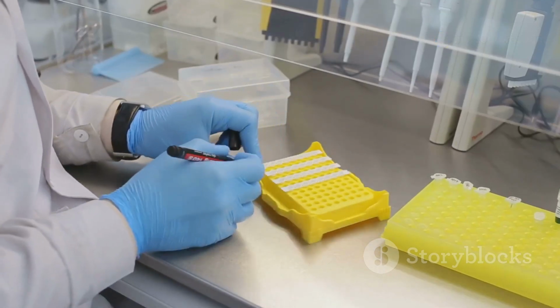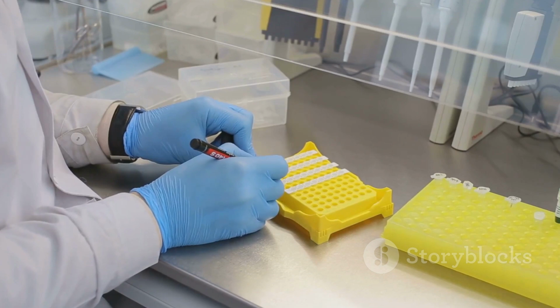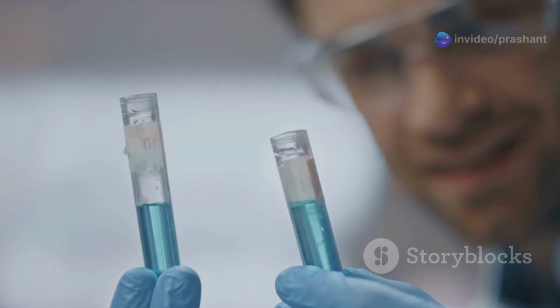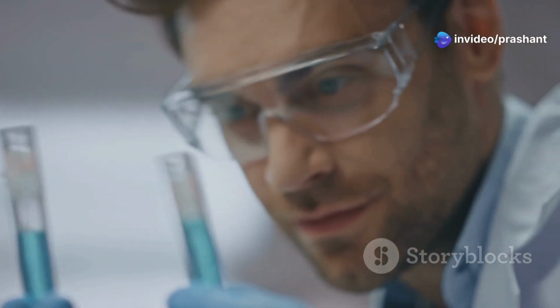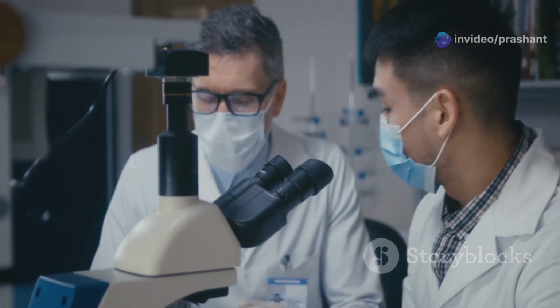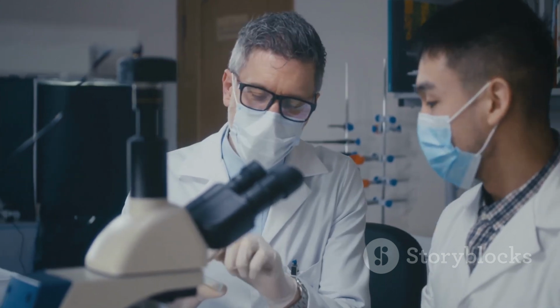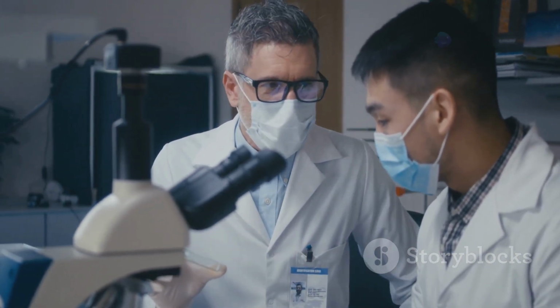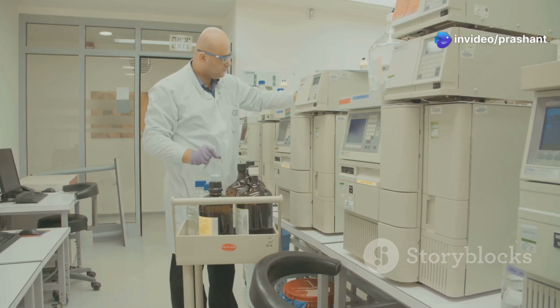In clinical diagnostics, electrophoresis is used to identify proteins or genetic mutations, helping diagnose diseases like hemophilia, sickle cell anemia, and genetic disorders. And in quality control, electrophoresis ensures that biopharmaceuticals like vaccines and monoclonal antibodies meet purity and potency standards.